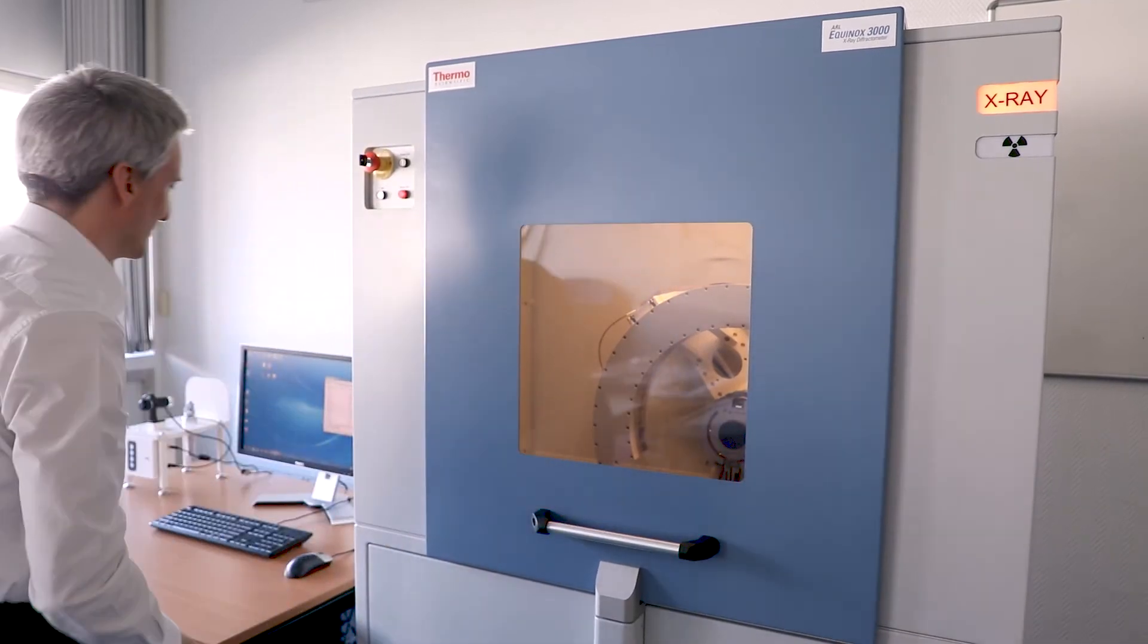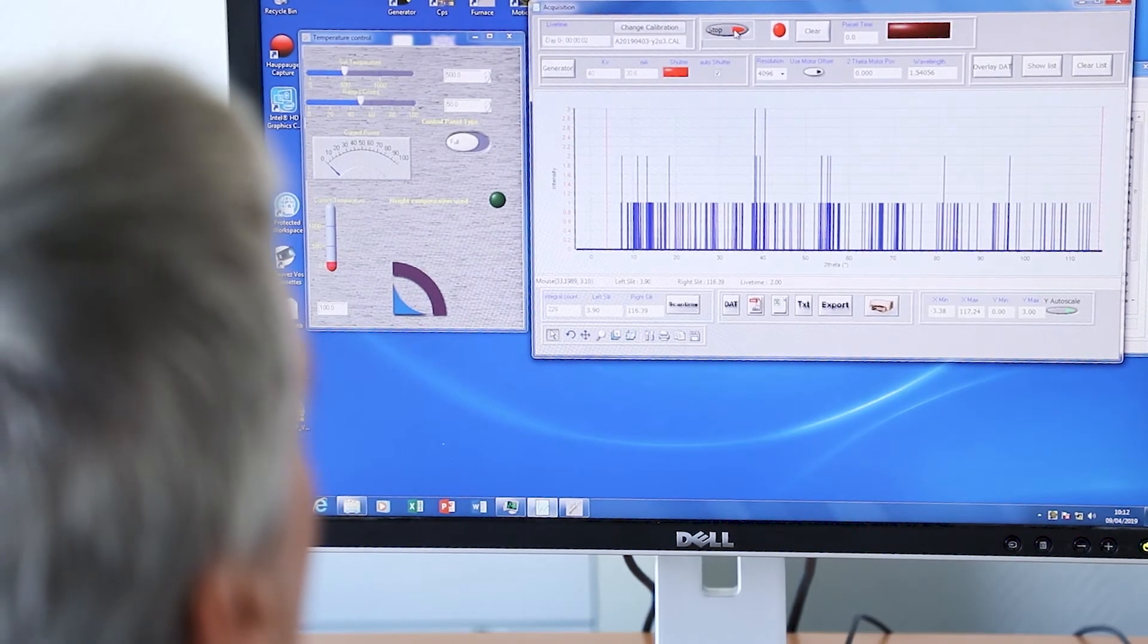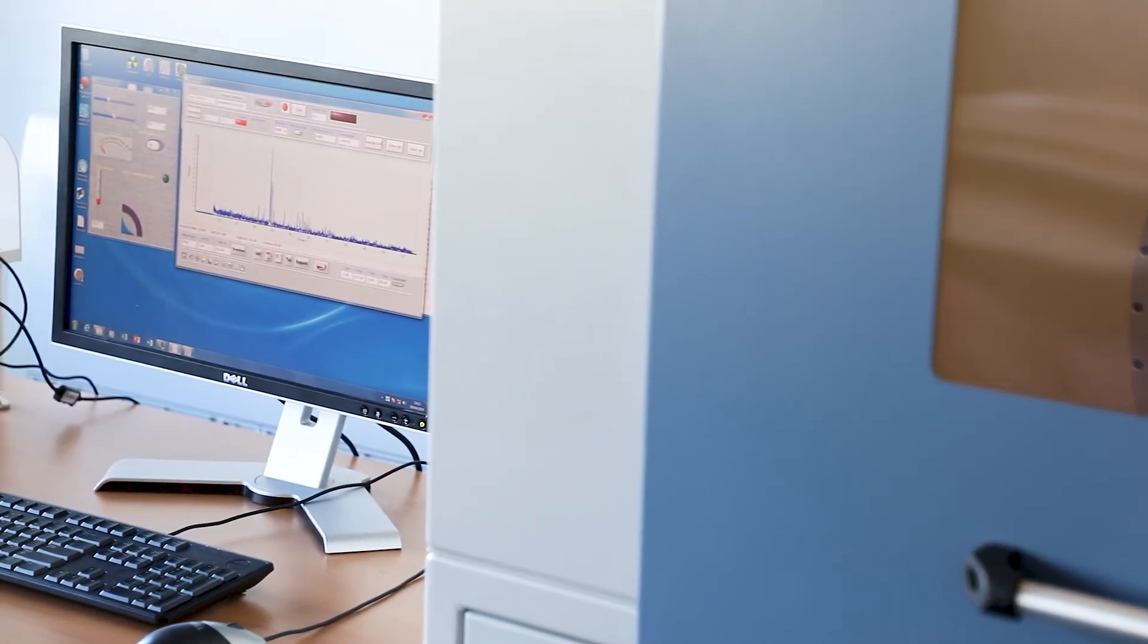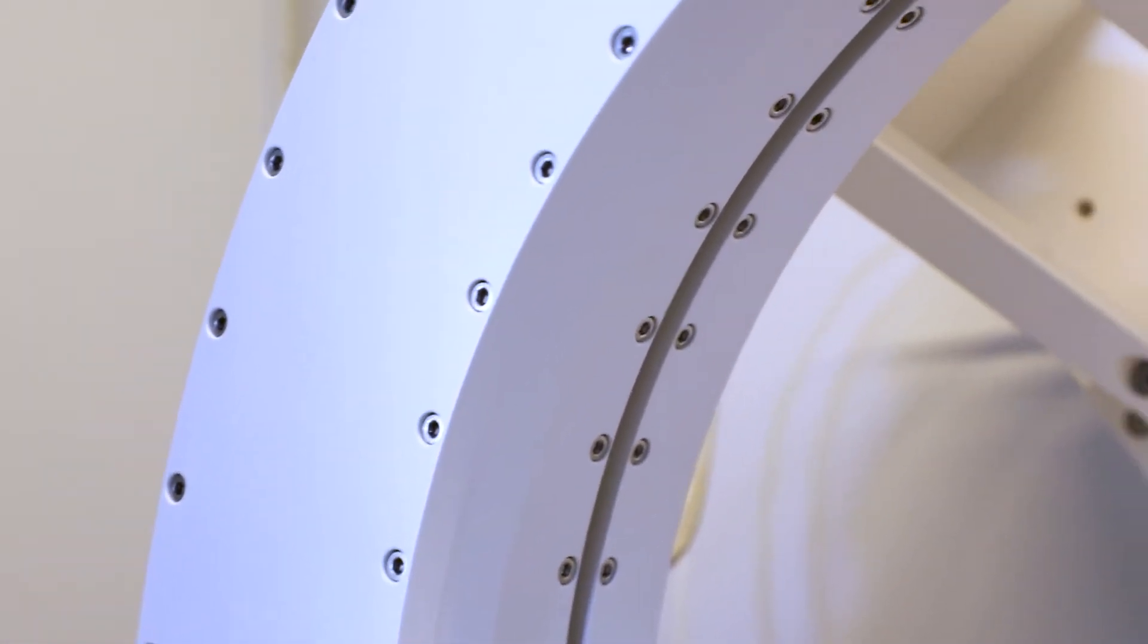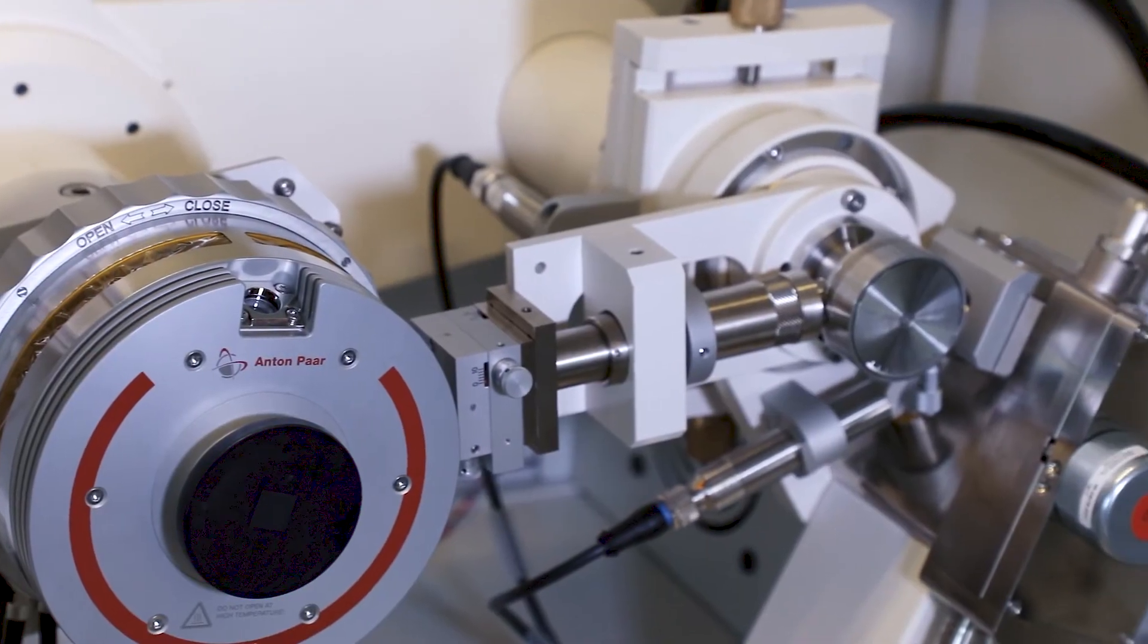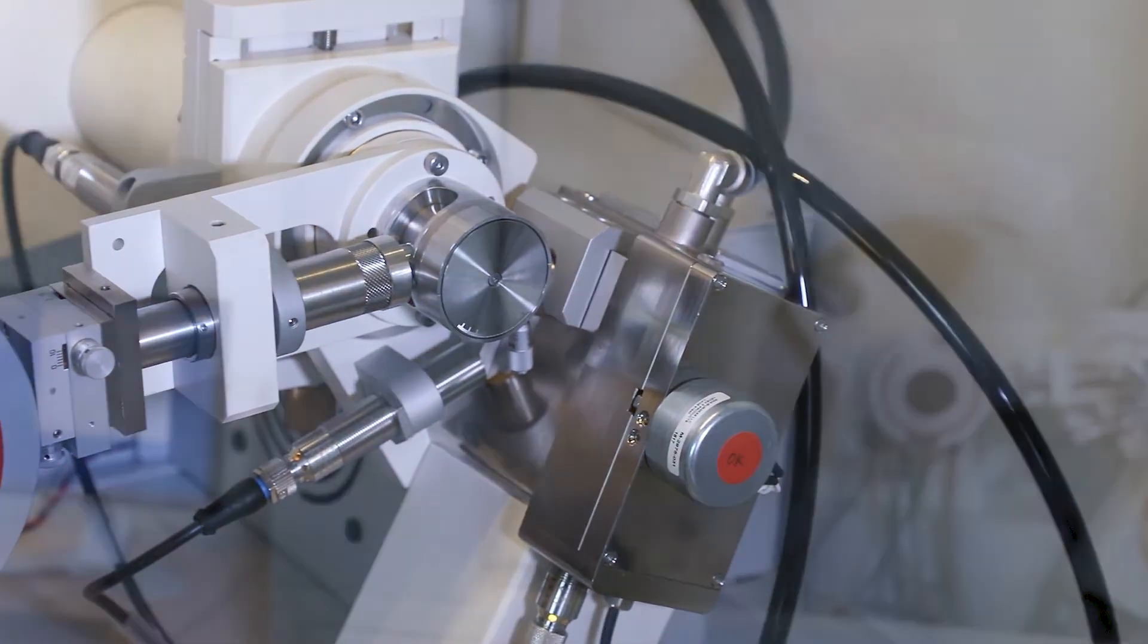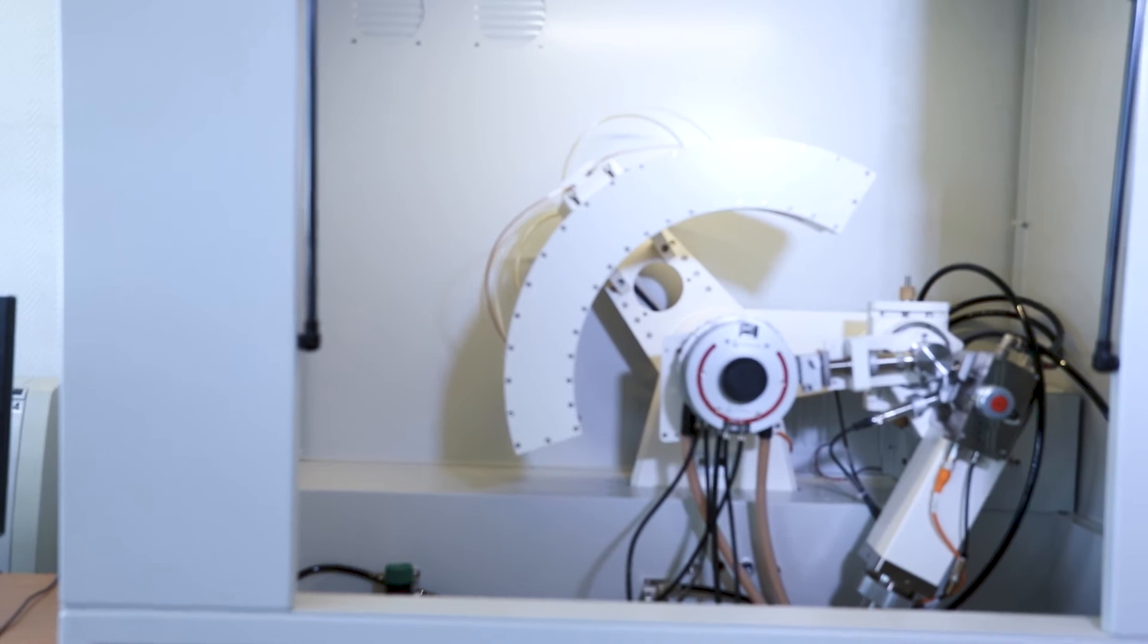Studies of physical and chemical properties of materials as a function of temperature, environment, pressure, and other conditions require dynamic crystallographic measurements in real-time. The ARL Equinox XRD instruments can capture these changes as they occur, thanks to their position-sensitive detectors which capture the complete XRD spectrum simultaneously, ensuring that no transition is missed during a measurement, which is especially important with unstable compounds.